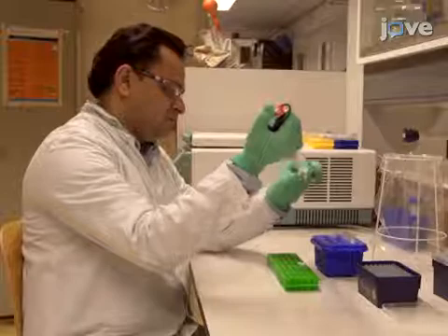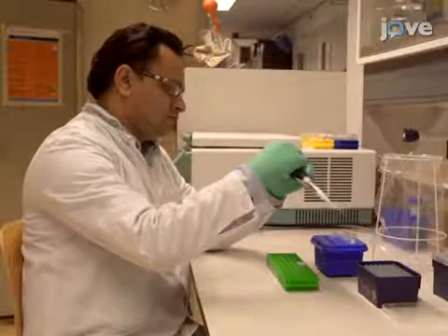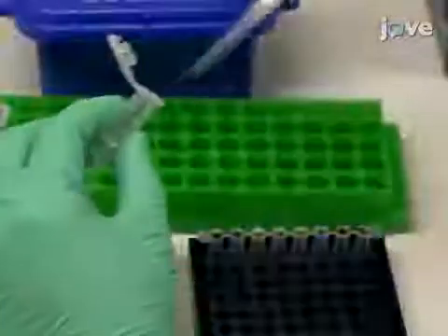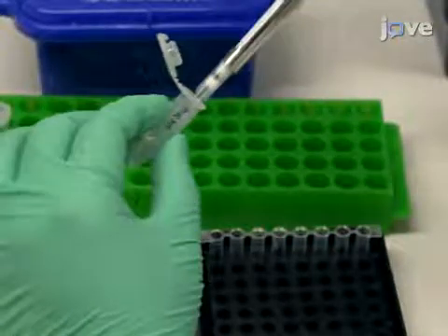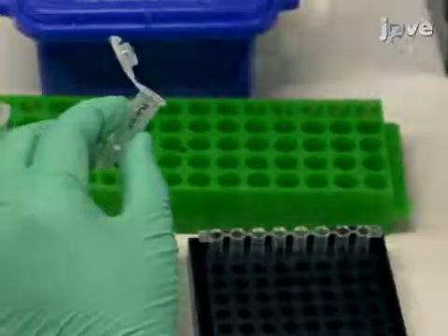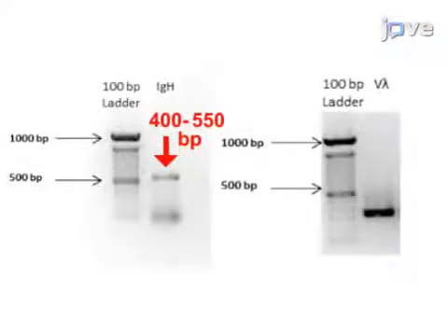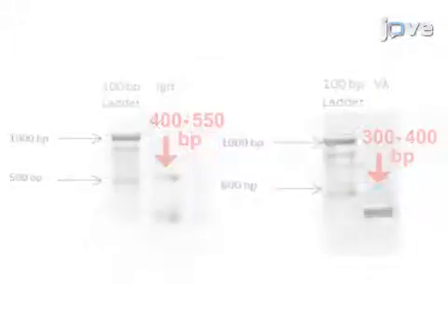To begin, follow the text protocol to synthesize copy DNA from the positive clones. Then, set up PCRs for the IgG heavy, kappa, and lambda chain. In the results, find the heavy chain at 400 to 550 base pairs. Find the light chain at 300 to 400 base pairs.